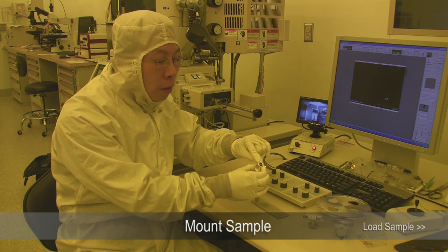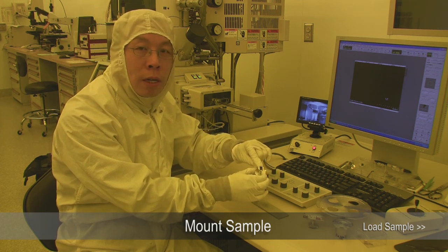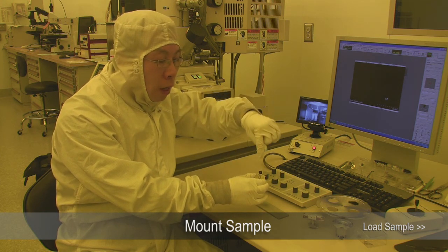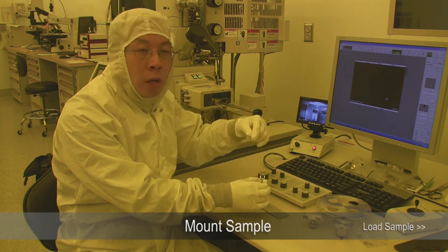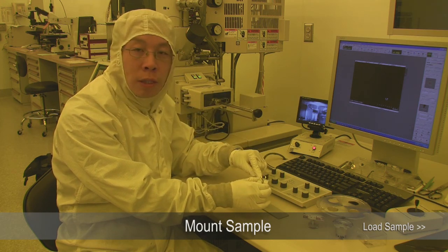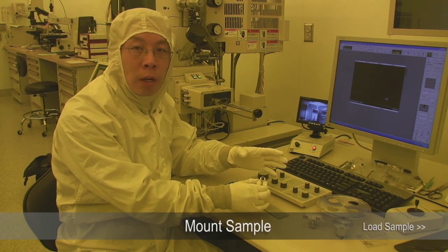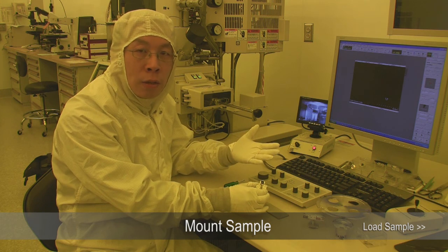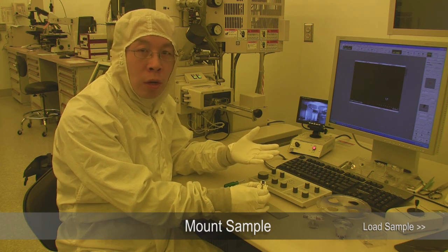This is a special double-sided tape made of carbon. It's very important to have the tape be conductive because this is a scanning electron microscope. An electron is going to go to the sample, and if you don't have a conductive path for the electron to dissipate, your sample will charge up and deflect the electron, and then the scanning electron microscope will not be able to work.